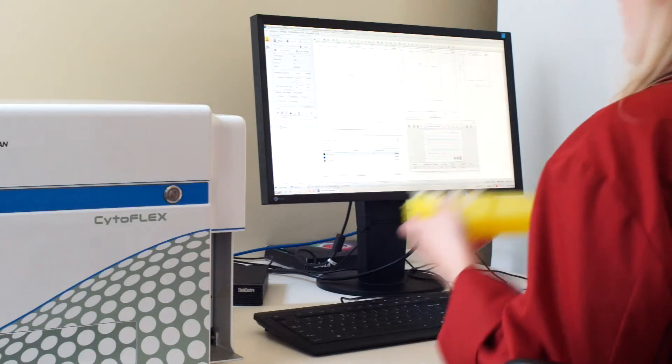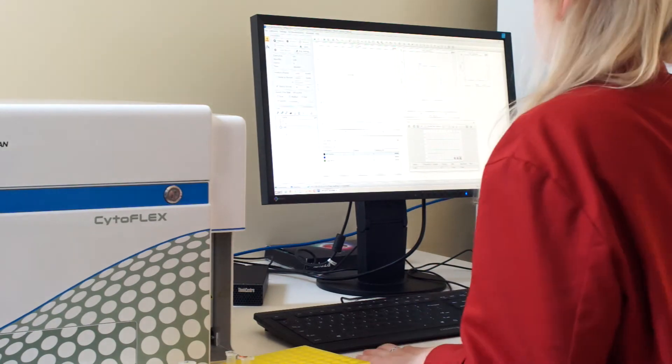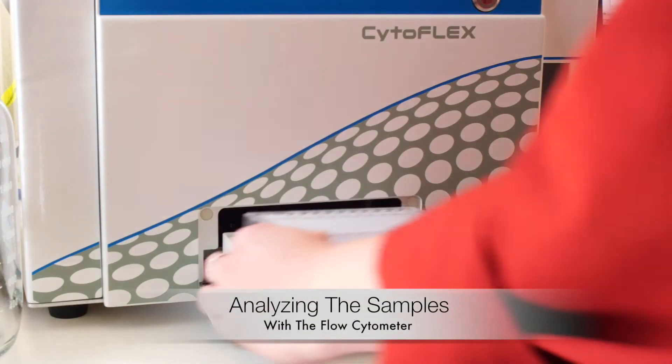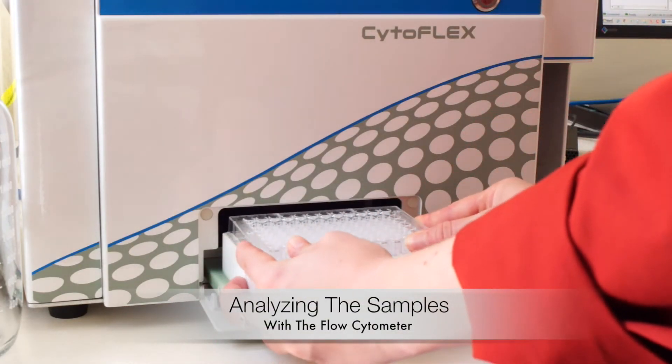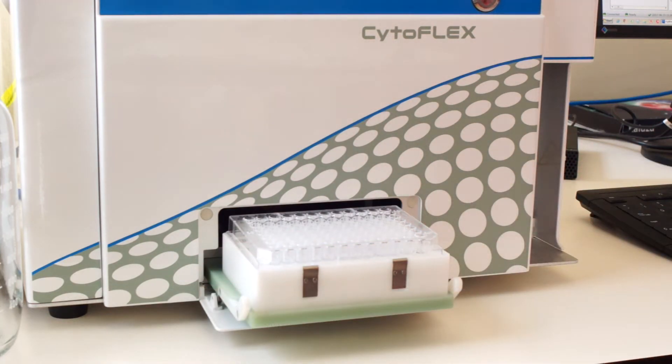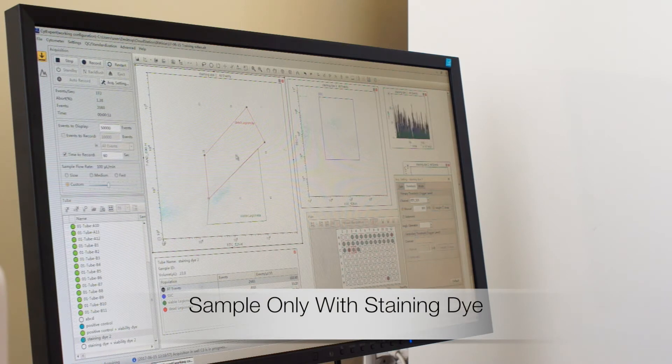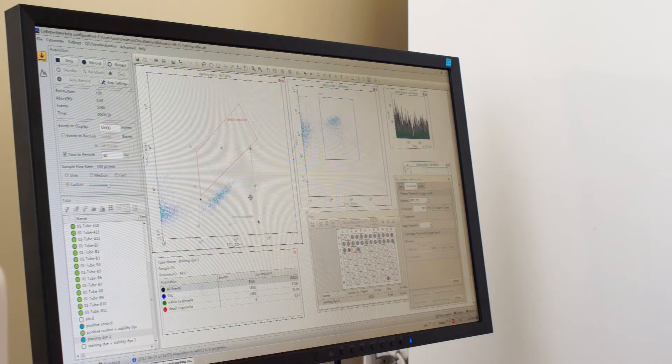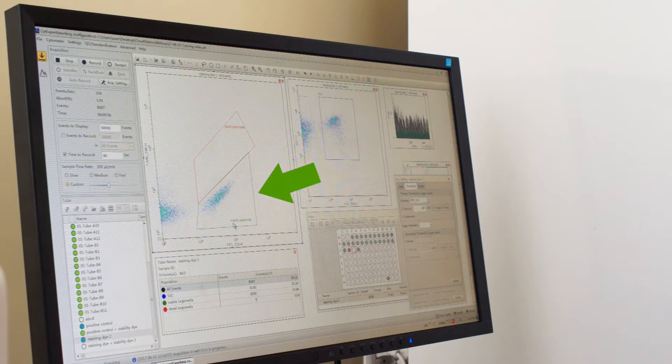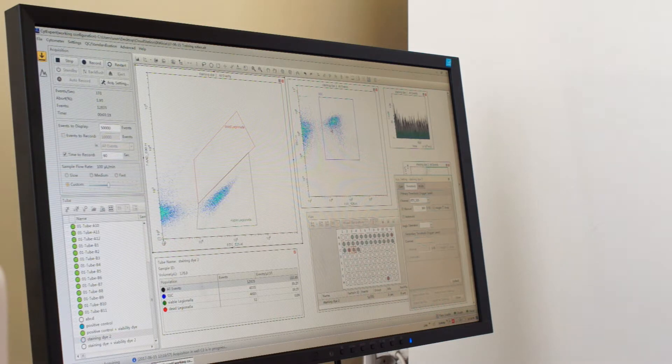In this last step I am quantifying the target cells with a flow cytometer. Here I am looking at the sample that was only stained with green staining dye. All Legionella cells that were present in this sample, dead or alive, are visible as this population here in the green area. A major advantage of the RQ Macro method is that also viable but non-culturable cells are detected.